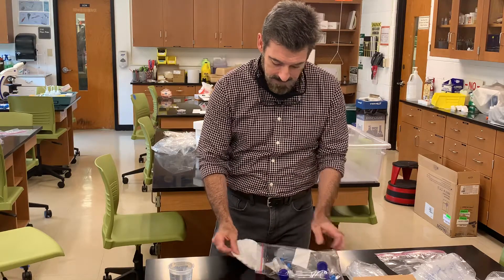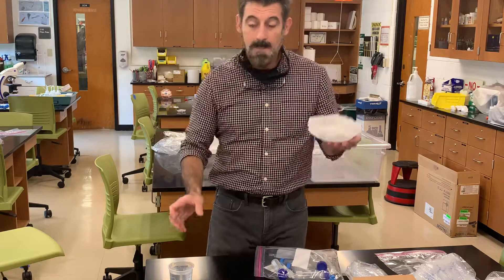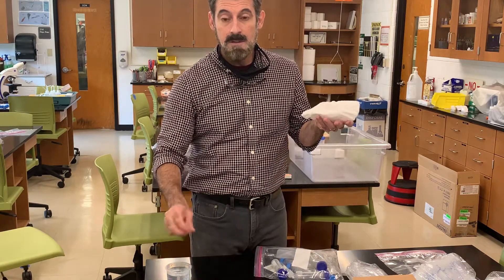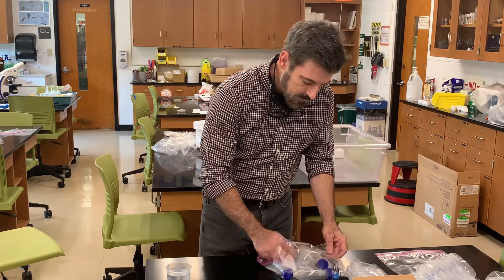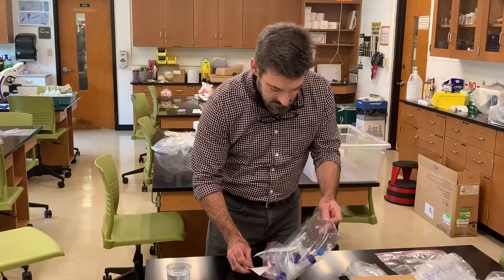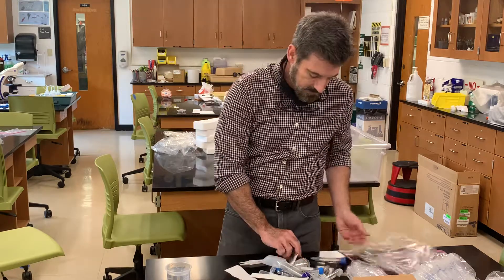In this packet you're going to find coffee filters, which you can also just get at home. They'll be used for filtering material when you extract an enzyme during one of the first labs. During that lab you'll also empty out everything in the kit so you can actually see what's inside.